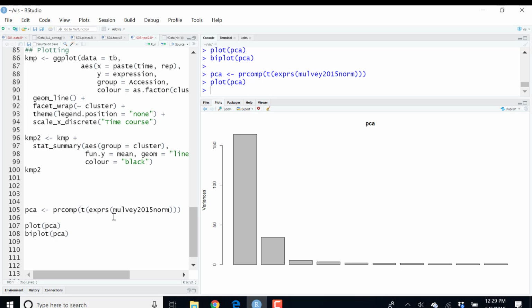Okay, and then I had 72 hours somewhere here, and then I had 0 and 60 somewhere here, and then probably 24. So this is one application of my PCA plot, where I want to have my columns in PCA space.